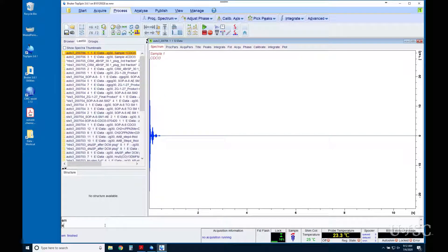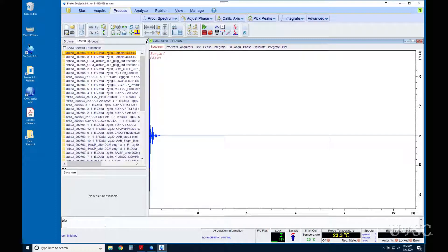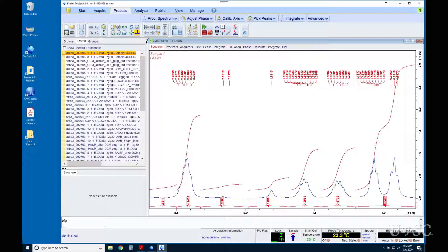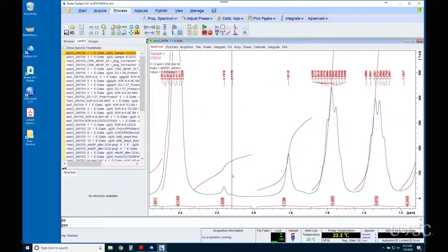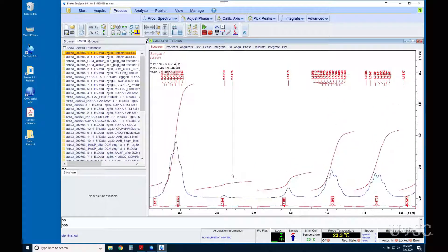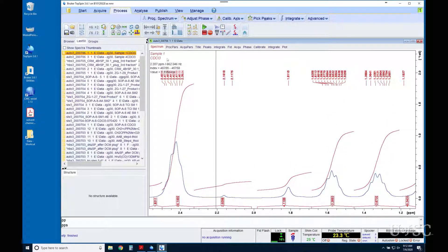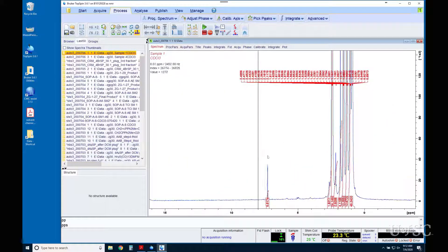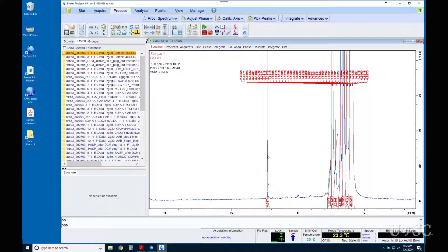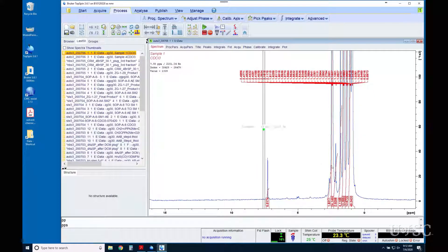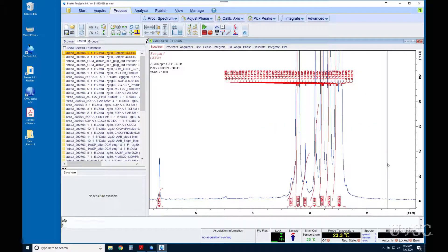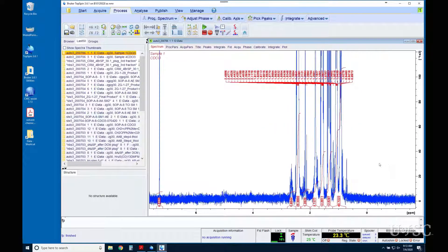If we process the data with EFP, note how the peaks are much broader than before and the noise has been mostly removed. Line broadening is a non-destructive and reversible step so feel free to experiment. To reprocess data without any line broadening, you could use the FP command, which does not perform the exponential multiplication before the Fourier transform.